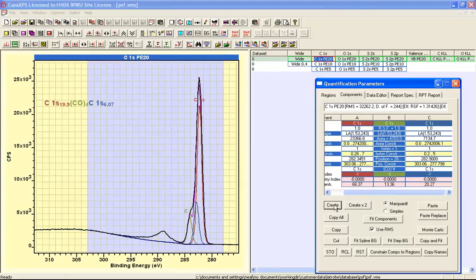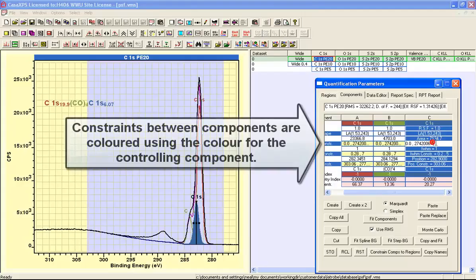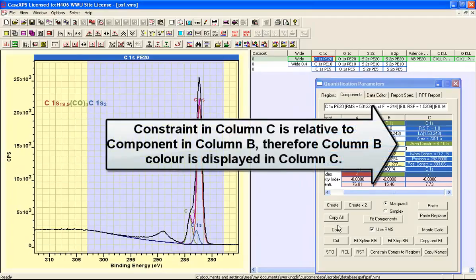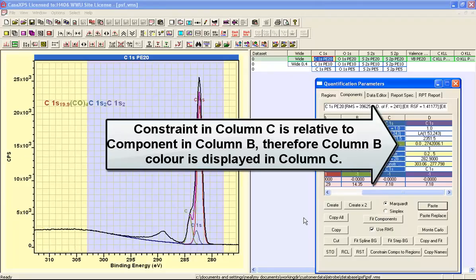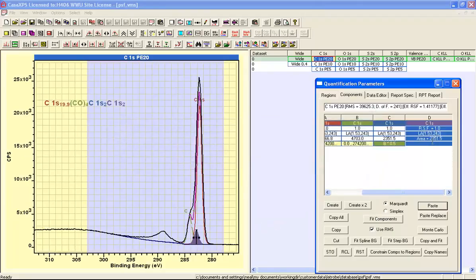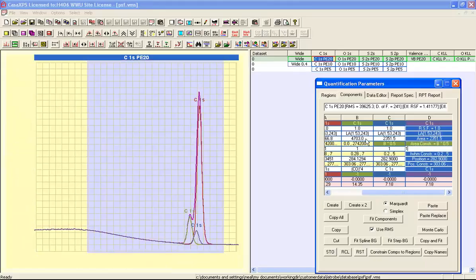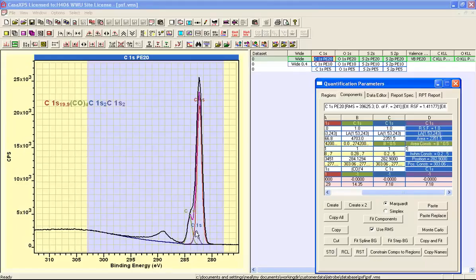So now add 2 more peaks, and I think this one here is going to be one of the CH3 or the sulfur peaks, and both of these ought to be half the size of the oxygen. So that's one. I'll copy that and paste, and that needs to be B star 0.5. So I have 2 peaks here.